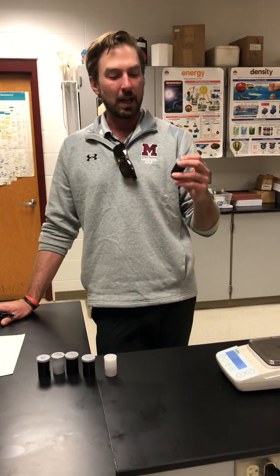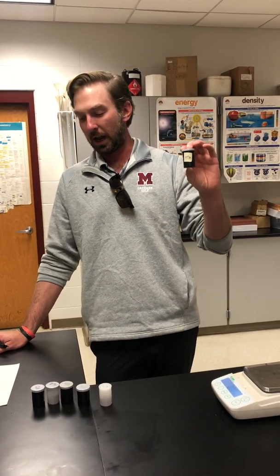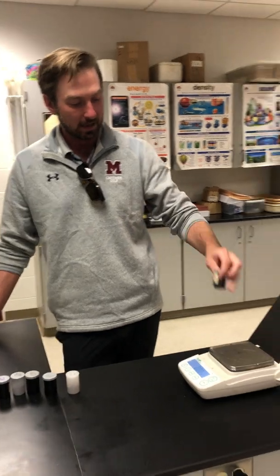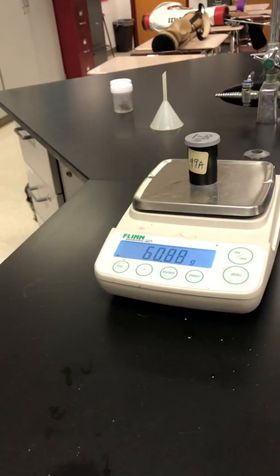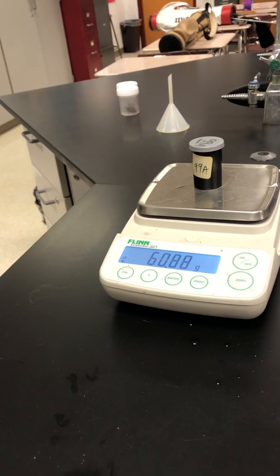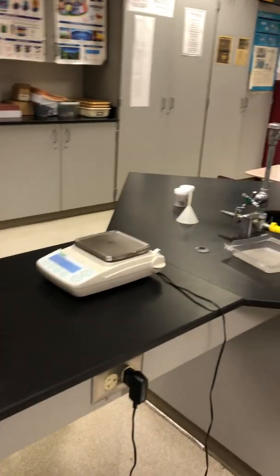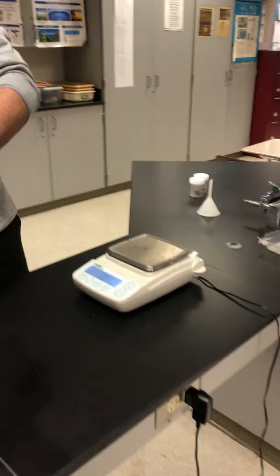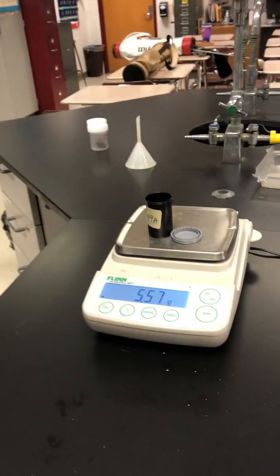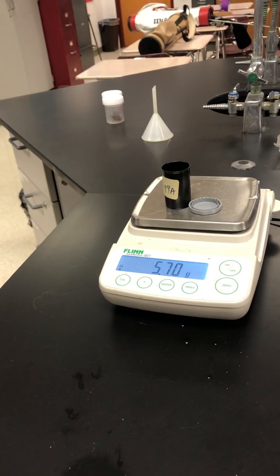Okay, if your last name starts with A to D, you are going to have container 99A. And 99A has a mass of 60.88 grams. If your last name is between... Don't you have to dump it out? You need the mass of the container. Oh, let's get the mass of the container for 99A. That is 5.70 grams.